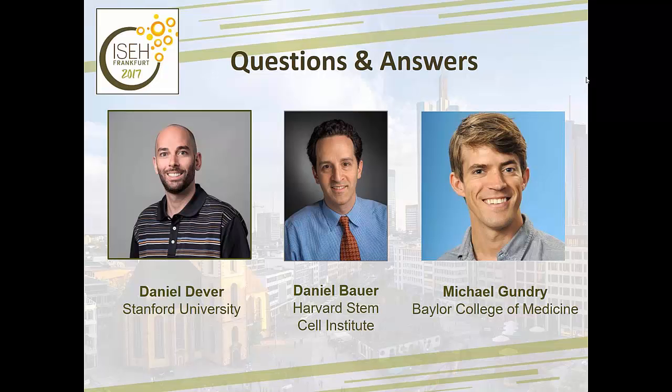I can follow up. I think that Dr. Bauer was right on with the controls. That's what we've moved towards for all of our experiments. Again, it's ideal to use a neutral locus, either a non-coding region or a gene that's not expressed in your cell type. But you have to make sure that your actual cleavage efficiency with that site is high.